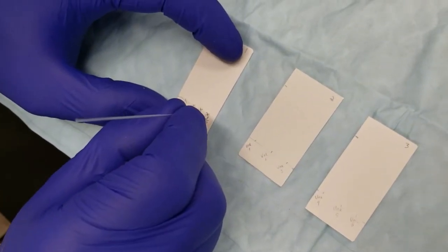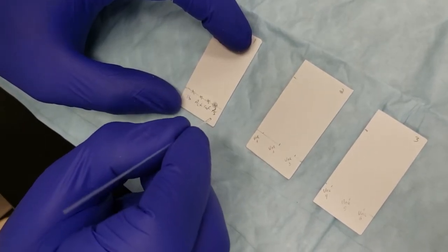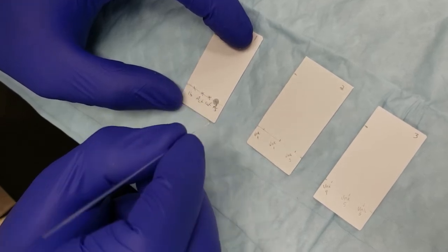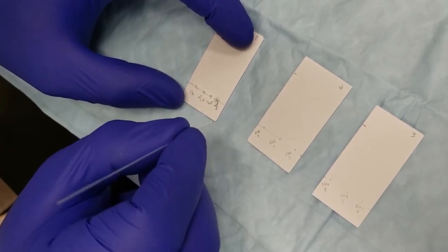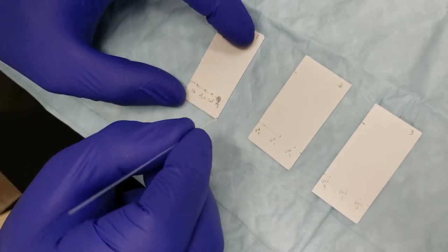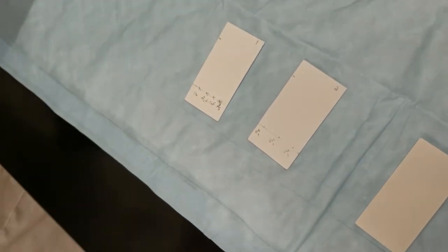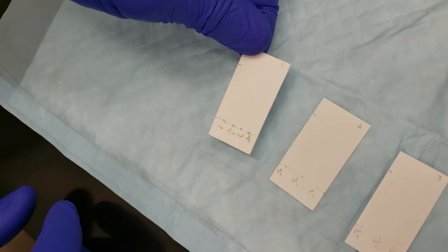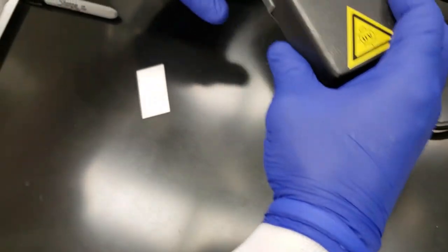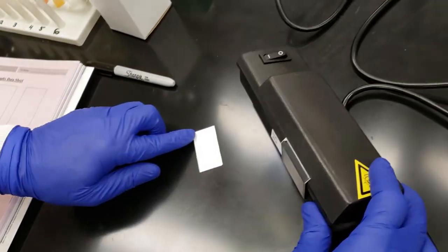In our final lane here. And there we go. So that is our spotting technique for plate number one. Let's take it over to our UV lamp and make sure that we can see very clearly all the spots for our compounds.